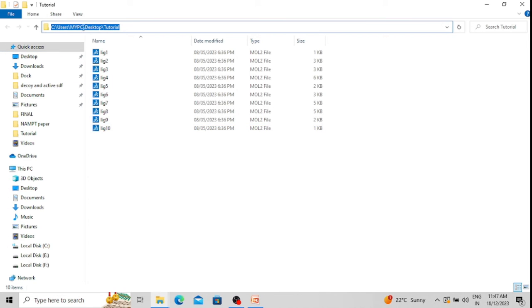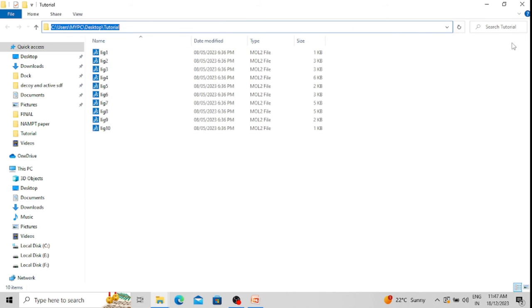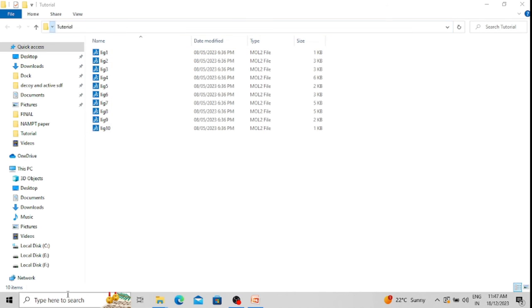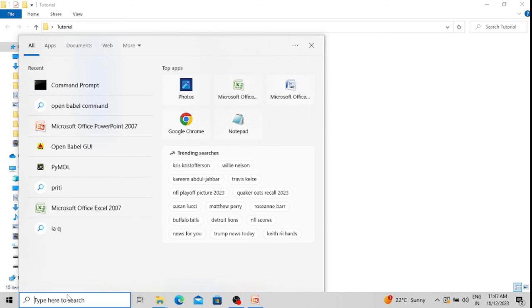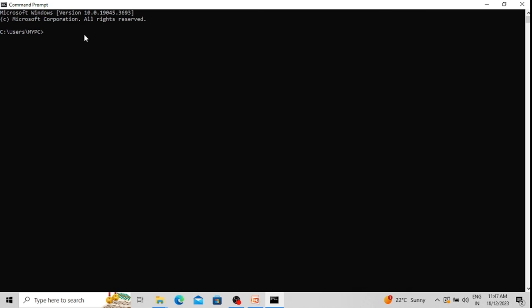First, we need to find the path of the folder containing the files. The path is: Users > mycp > Desktop > tutorial. I am copying this path to use in the command line interface. In the Windows command prompt, I type 'cd' — which means 'change directory' — followed by the path to the tutorial folder, then press Enter. The command line interface now detects the location of the structural files, which are present in the tutorial folder.